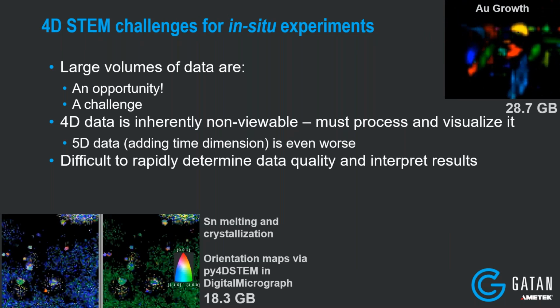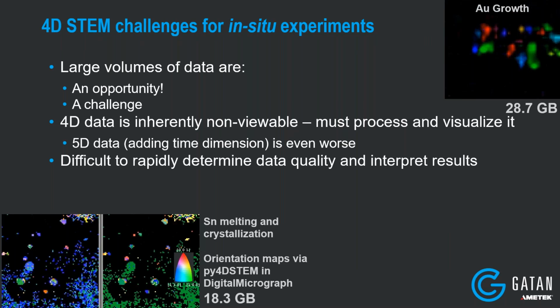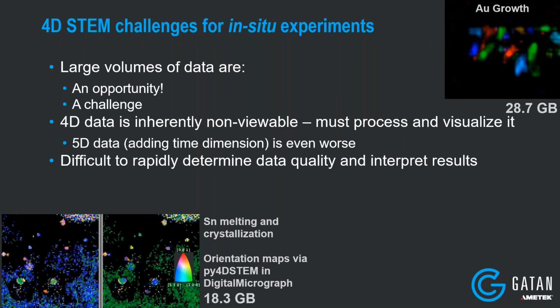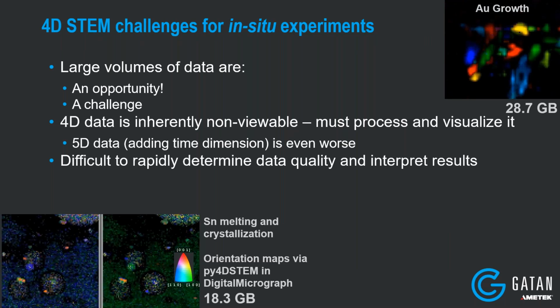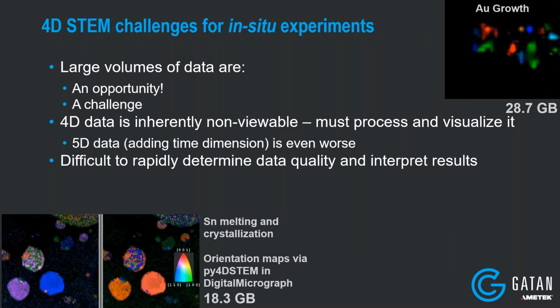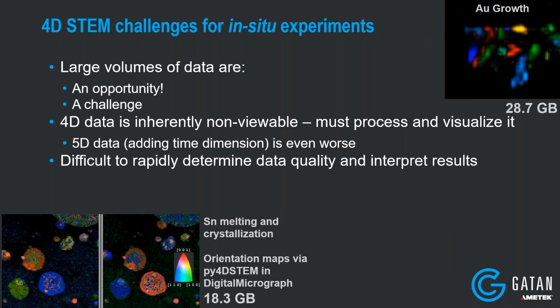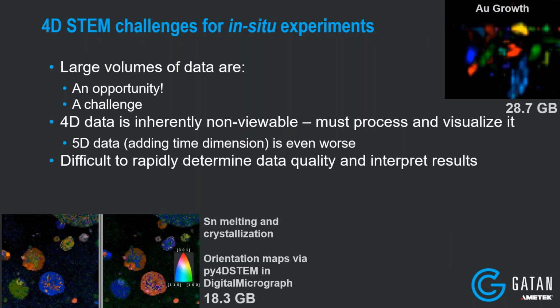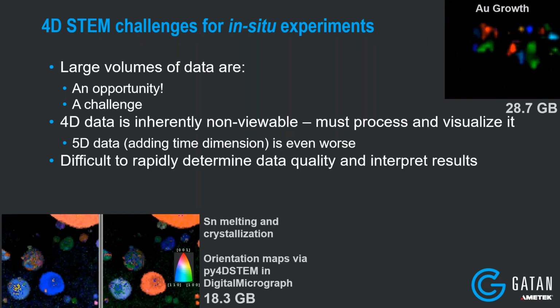And adding the time dimension now for in situ so that we have now five-dimensional data, this is even worse, right? We have even more dimensions that somehow need to be displayed to the user to understand and to visualize what's happening with my sample.